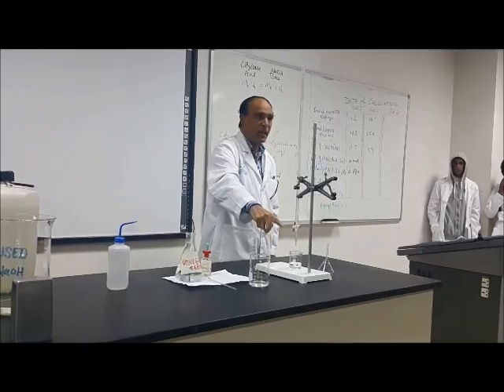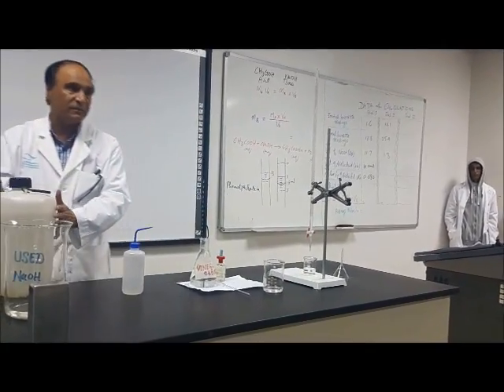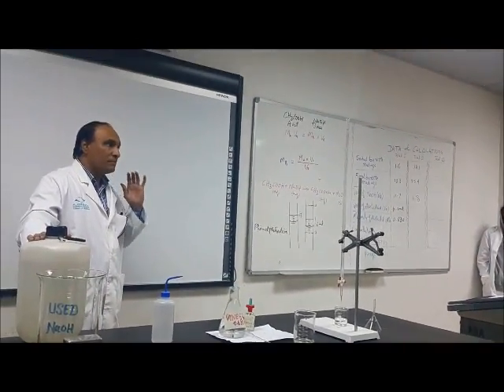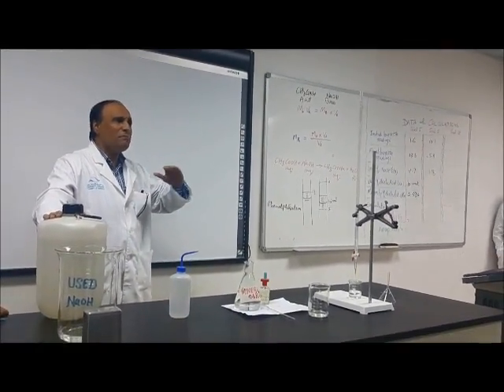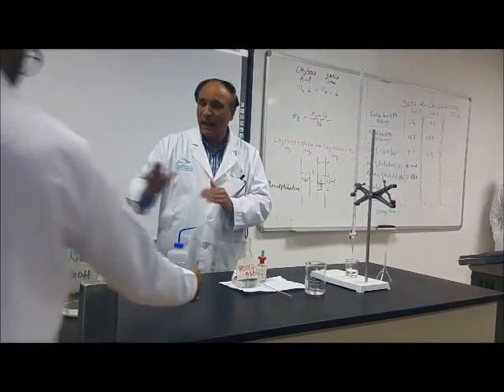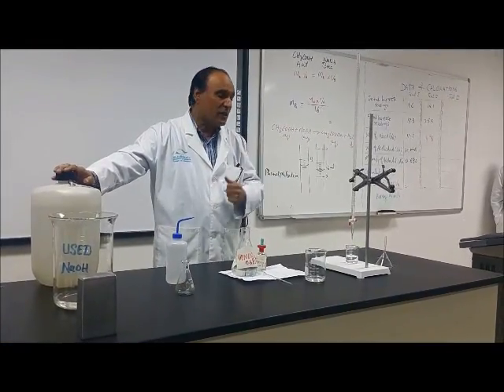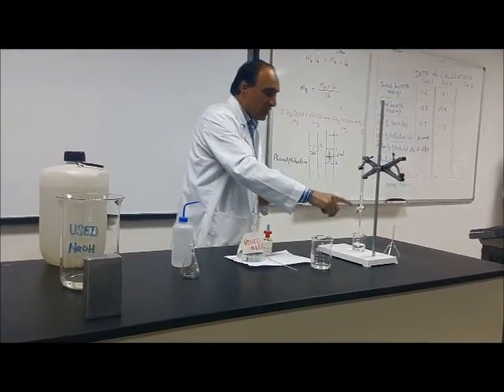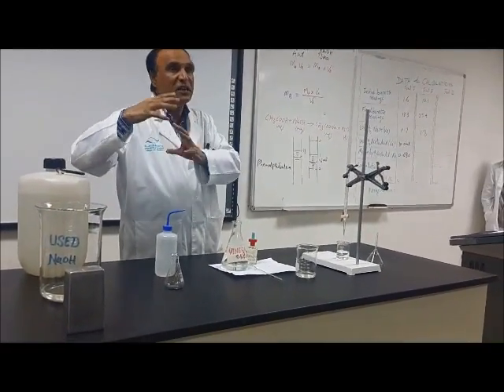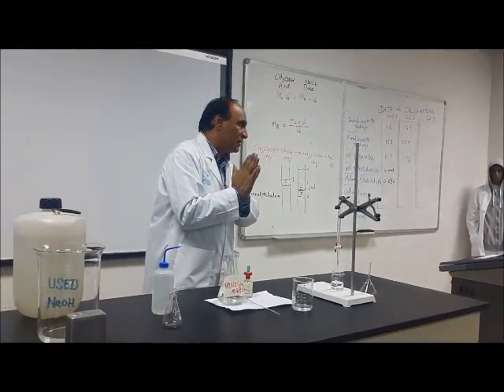This sodium hydroxide which is here, don't put it back over this. Why will you not put it back? Maybe it is not very clean, maybe some mistake has been done, and I don't want to make it wrong for the other groups. What you will do is collect it here and then put it in the big beaker. I will make it neat and clean, and then we can use it later.